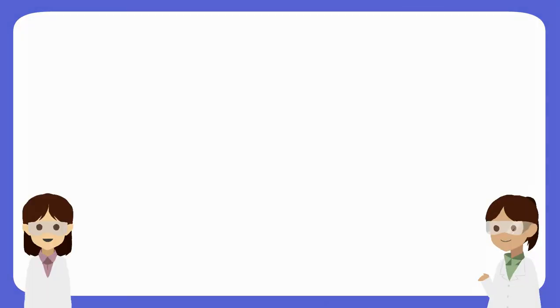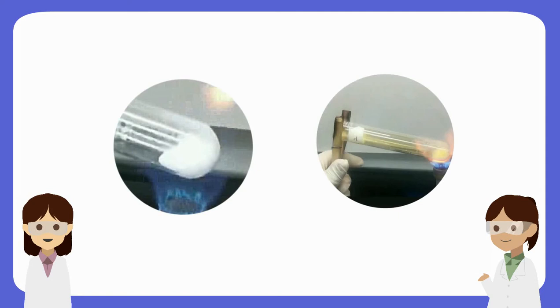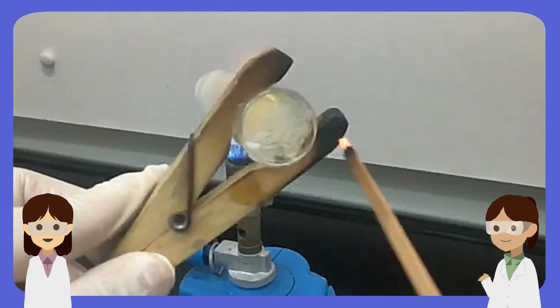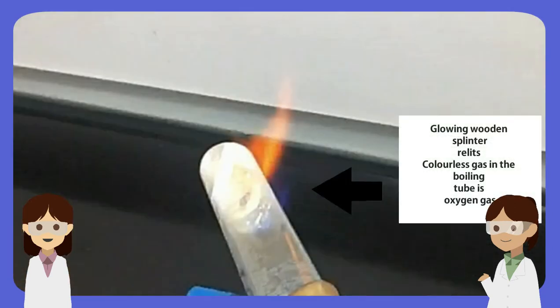Generally, the decomposition of Group 2 nitrates produces white solid and brown gas. To determine whether colorless gas is present, a glowing wooden splinter is placed into the mouth of the boiling tubes.